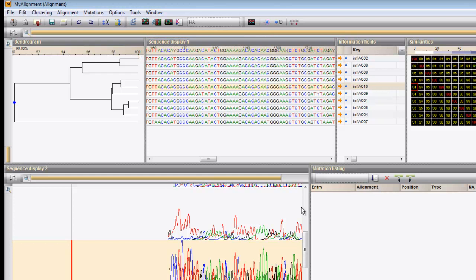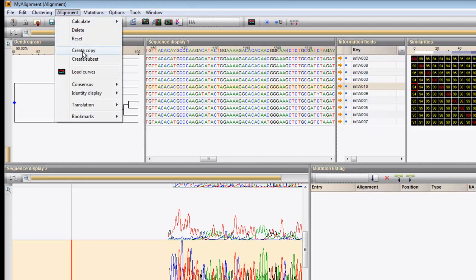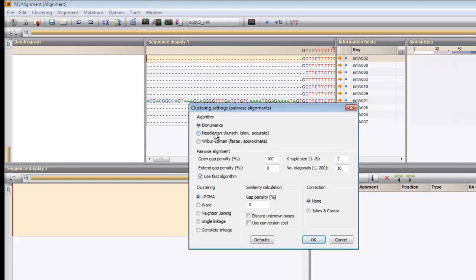Entries that were used to calculate the consensus are preceded by a blue dot in the information fields panel. In case you would like to keep the current alignment unaltered while at the same time evaluate alternative settings, a copy of the alignment can be created with Alignment > Create Copy. Now we can, for instance, create a dendrogram according to the Needleman-Wunsch algorithm.